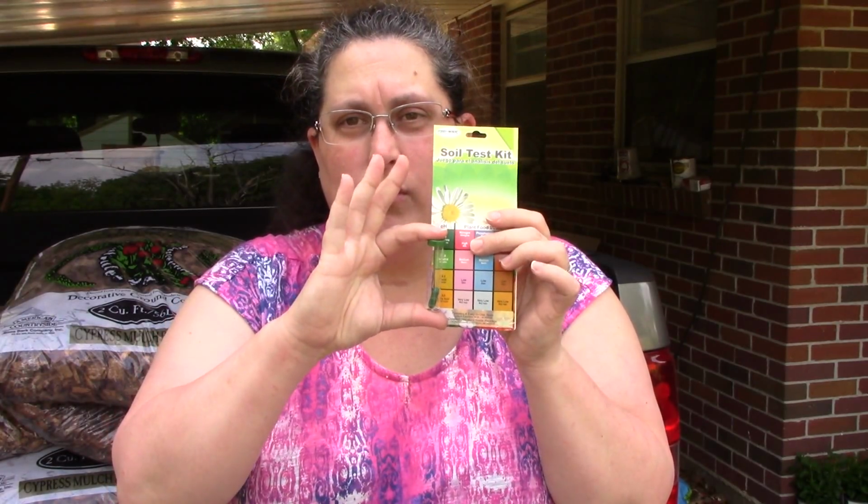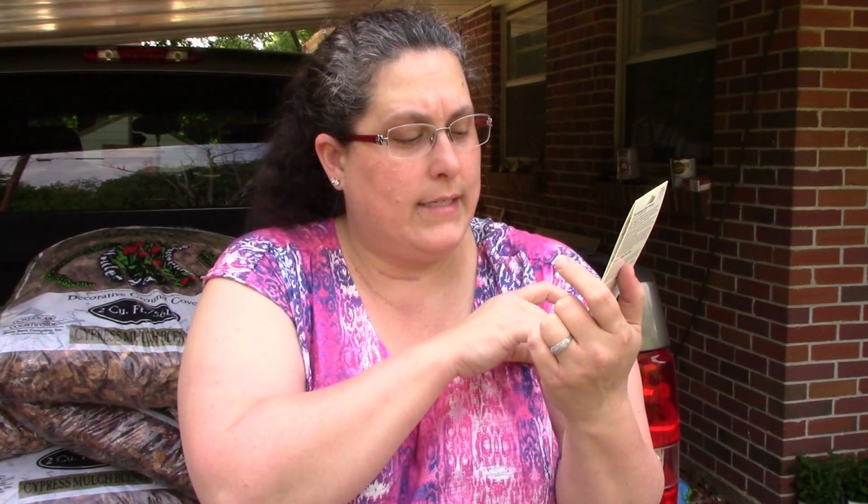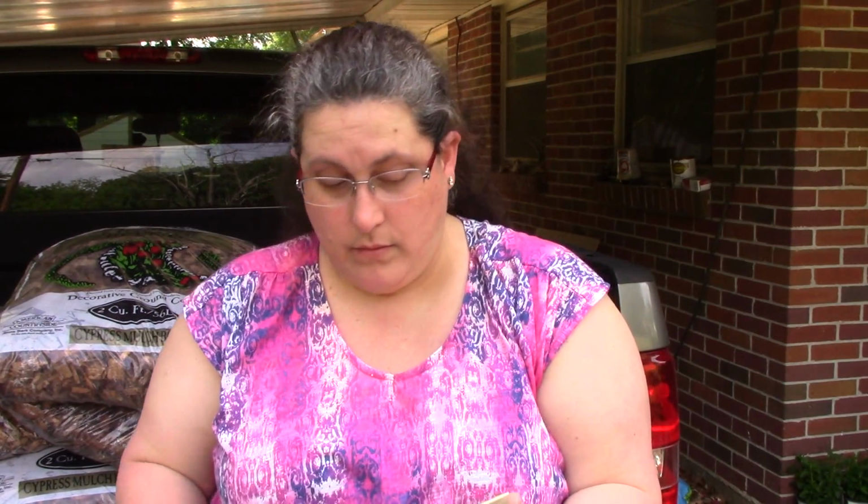After you shake it up, after 1 minute the pH test will be done, and you look at it with this little chart and see where it would be, and it'll tell you if it's alkaline, neutral, acid, or very acid. And then it does the same with medium, high, low, and very low for the nitrogen, phosphorus, and potash. But with the other 3, instead of just waiting a minute, you have to wait 10 minutes for them to be fully done. It says it's best to use outside, and then whenever you have it all done, you'll know what your different levels are.